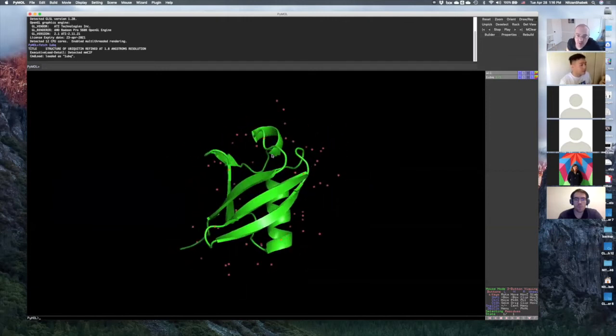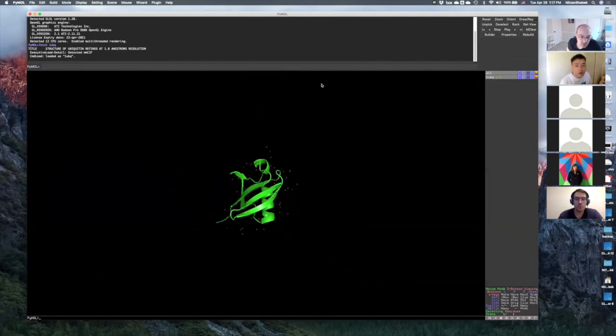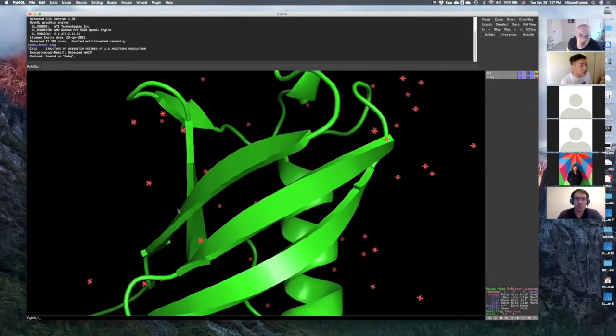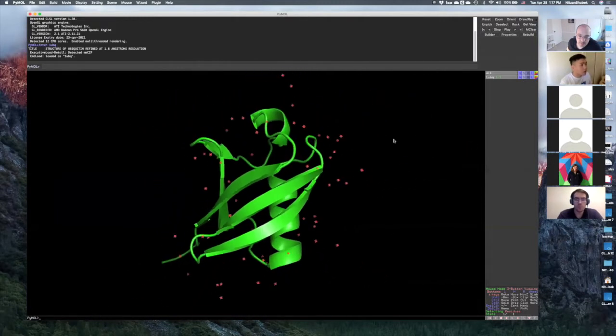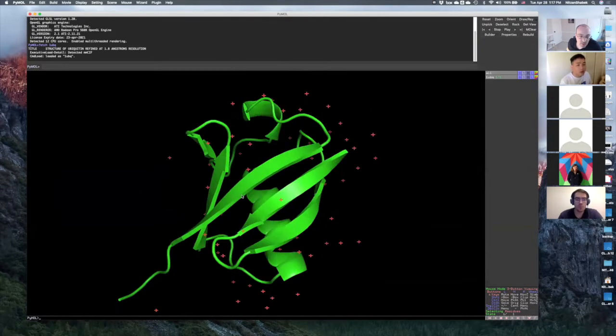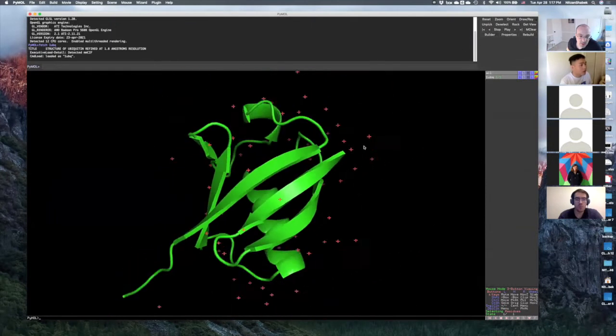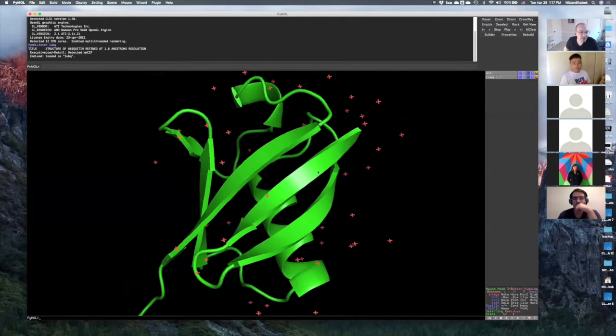The right click of the mouse, if you keep it pressed and go up and down or to the sides, you can zoom in and zoom out on what you see, okay? So the left click kept pressed, you can move it. The right click kept pressed, you can zoom it. Everyone can do it? Okay, good.